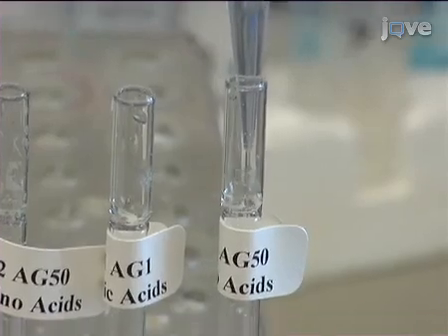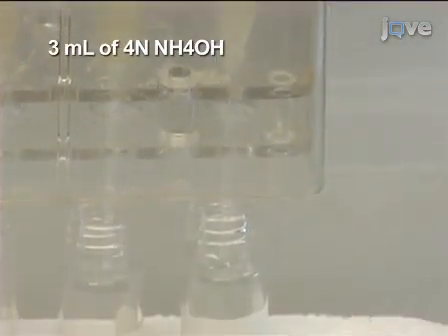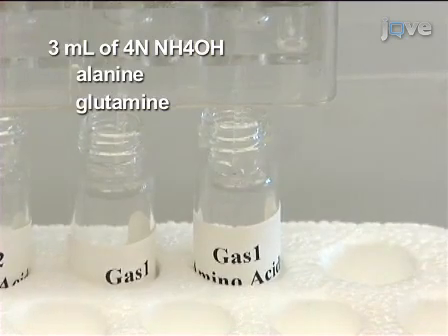For amino acid extraction, add 3 milliliters of 4 normal ammonium hydroxide to the Ag50 column. This permits analysis of isotope enrichment in total number of labeled carbons among 3 carbon species and 5 carbon species.